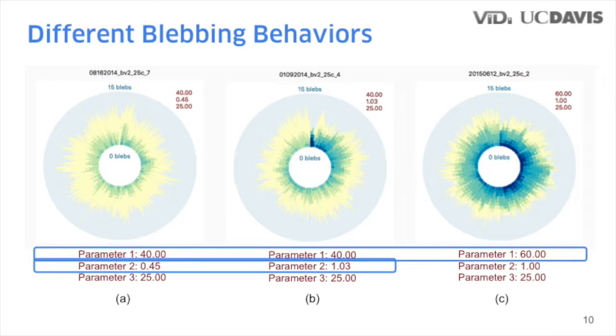From figure A and figure B, we can see that cell B forms bigger and more blebs during the whole process compared to cell A, which was triggered with 2.2 times lower stimulus. It was found that the larger magnitude of stimulus 2 triggers more intense continuous bleb formation. Further comparison shows that another type of stimulus, marked parameter 1, significantly triggers larger blebs compared to A and B.